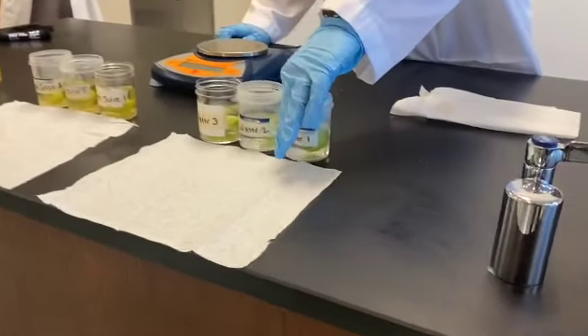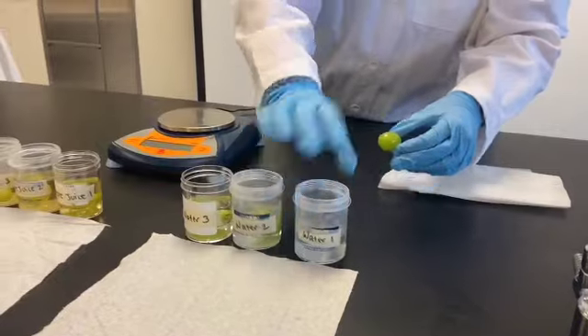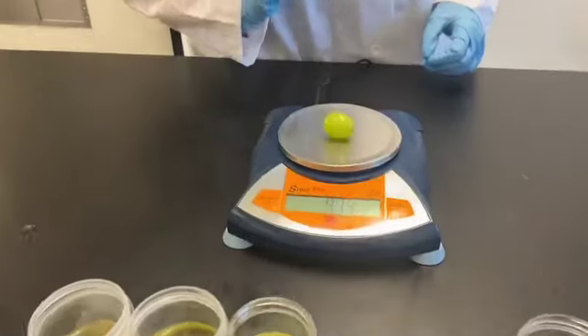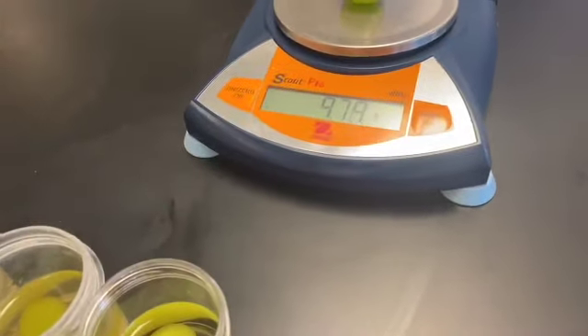So here is water number one. 9.78. 10. How great! 12. 20.